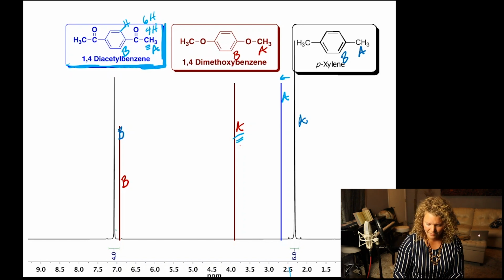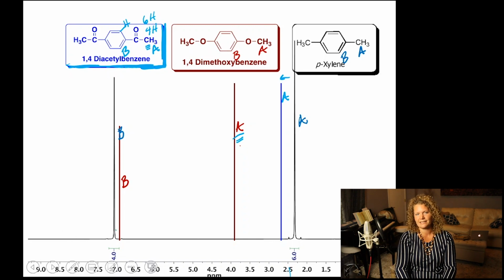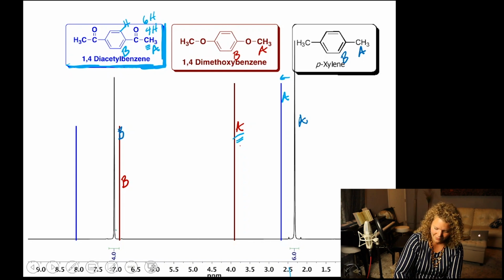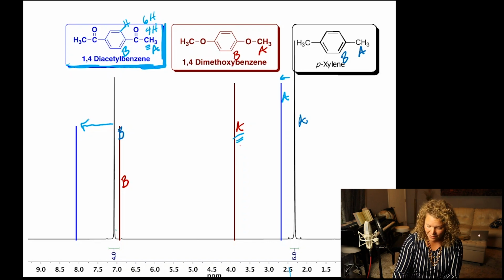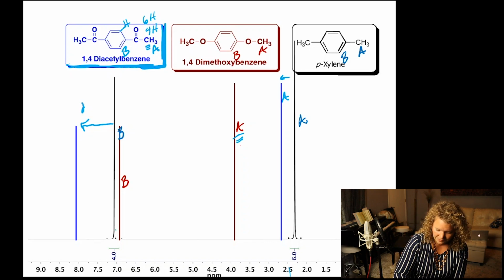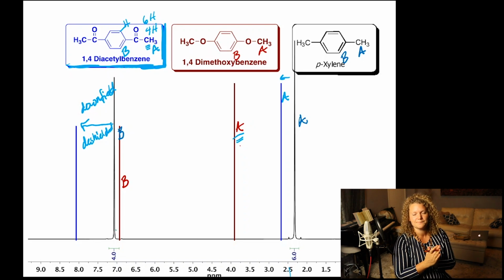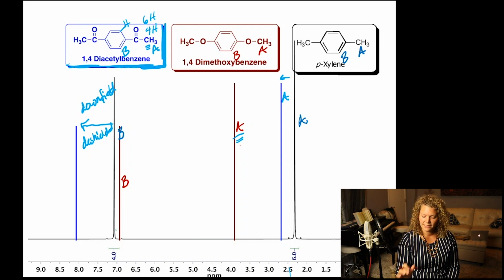Okay, what about the aromatic region? What does the carbonyl do to the aromatic region? Think about the resonance. Shifted it where? From paraxylene? Shifted it more downfield. Downfield. That means that these protons are de-shielded. Why is that? Carbonyl is de-shielding those CH bonds.